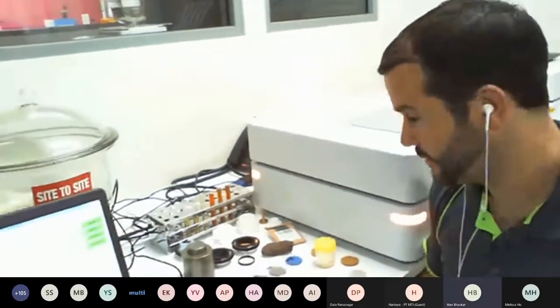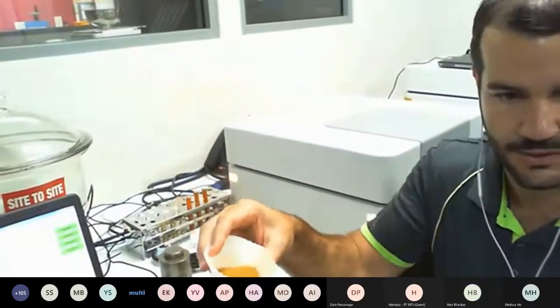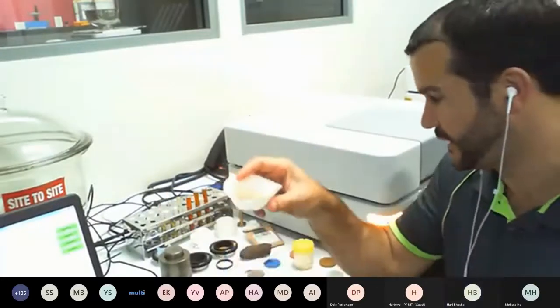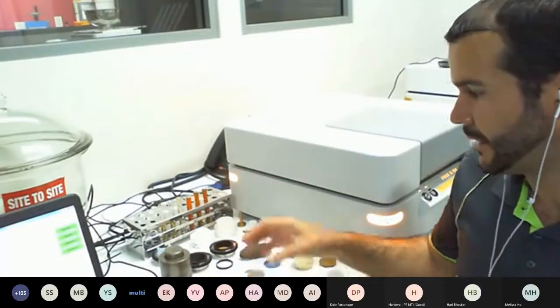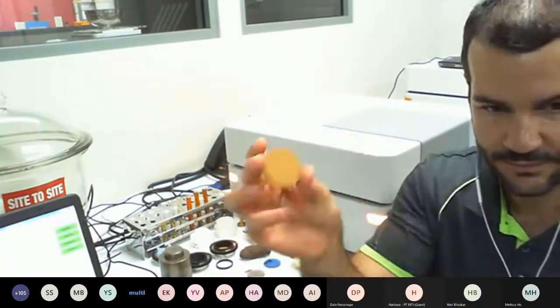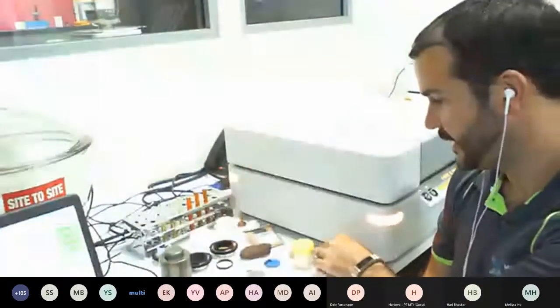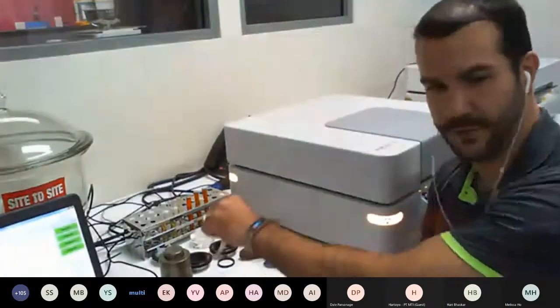As we go through, you can also measure directly on a loose powdered sample. So we've got some of our nickel samples here that are provided. And then from there, we can move up into our pressed pellets, which we've based all of our calibrations on here today, and then through to our fused beads.